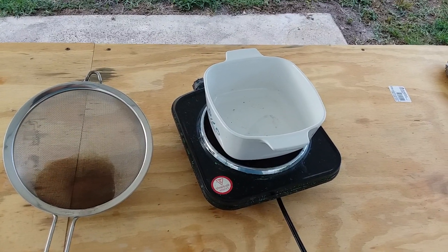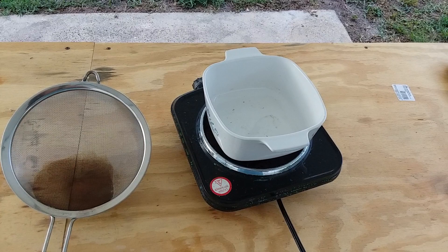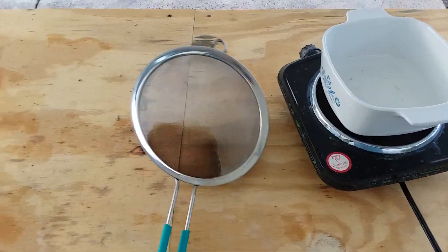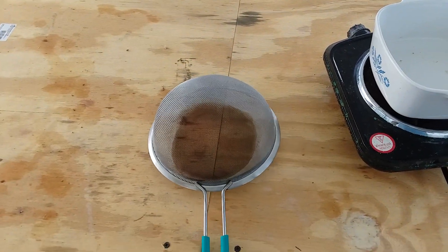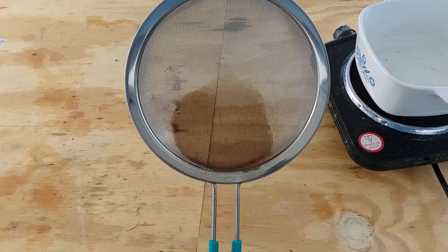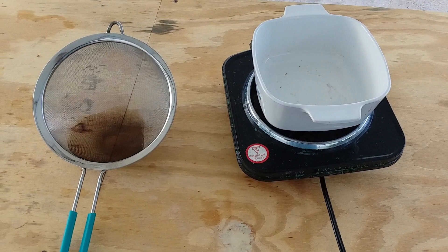So I was going to filter it again, but I thought, let me filter out all of this debris so I don't wind up blowing out another filter. So without thinking, I reached for this metal sieve, and I filtered out all of the debris through this metal sieve, and then proceeded to re-filter the liquid again.